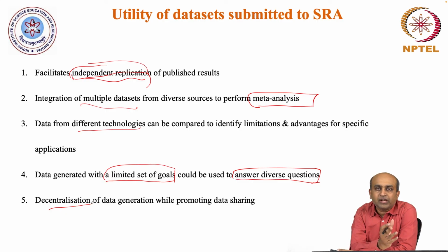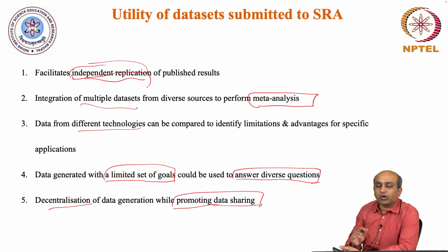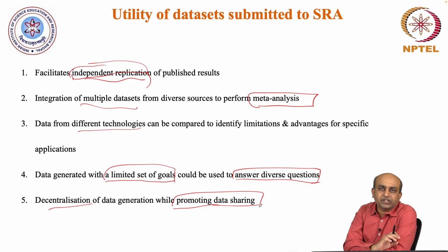So any other person can analyze this data, share it in whatever way, and promote various downstream analyses which this data sharing allows. This has been going on for quite a few years now, and as more and more data sets are generated and deposited on SRA, this has stimulated a lot of such diverse discovery and illuminated new biology.